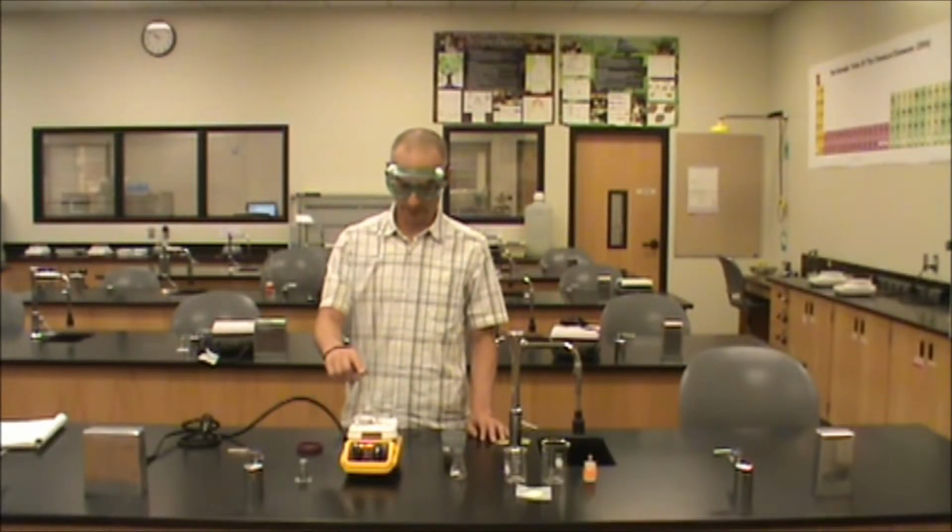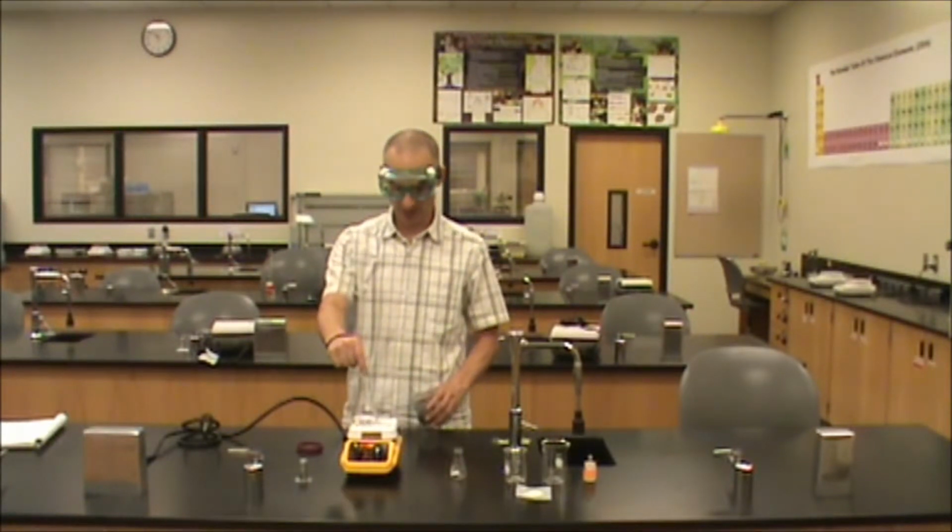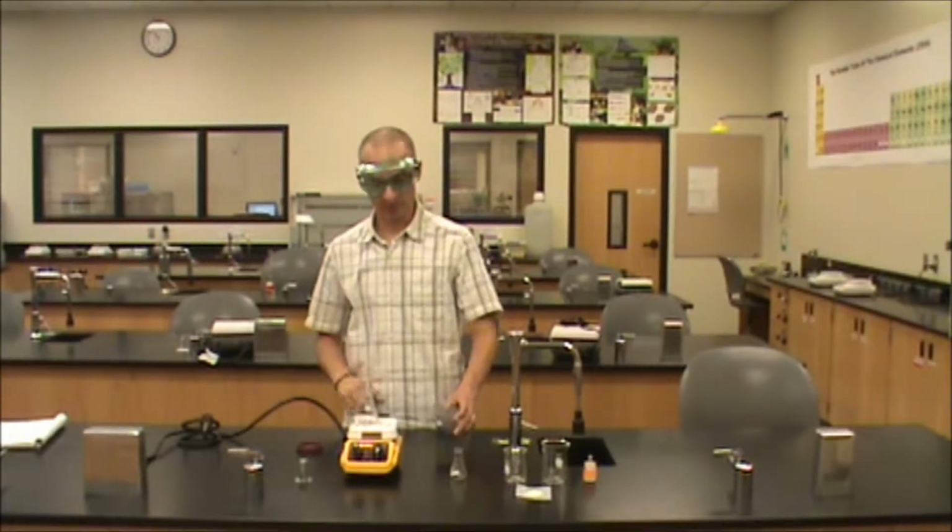I want to point out this method would ordinarily be conducted in a fume hood, but we're shooting it outside of the fume hood today, so it'll be easier to see for the camera. I've set up a stockpile of solvent on the hot plate to heat it up. I'm using an Erlenmeyer flask because the narrow neck minimizes the amount of evaporation. You want to be sure to add a few boiling chips to the solvent to prevent any bumping or splashing, so the bubbles have a place to form.